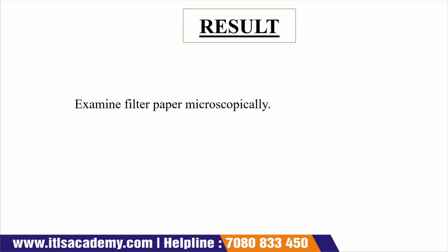Now the next one is your result. So the result is what? We examine this filter paper under a microscope.